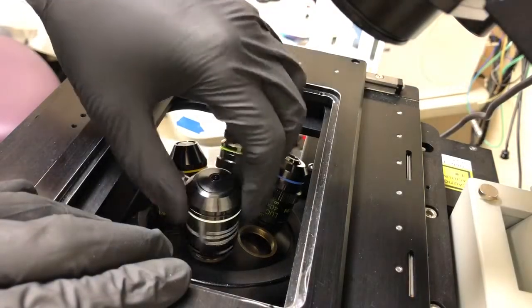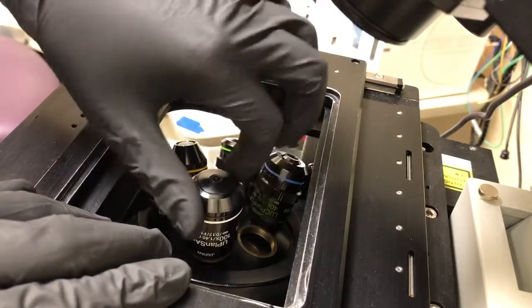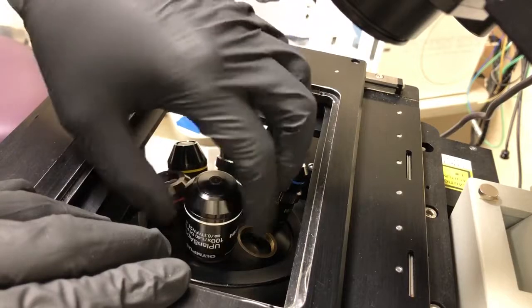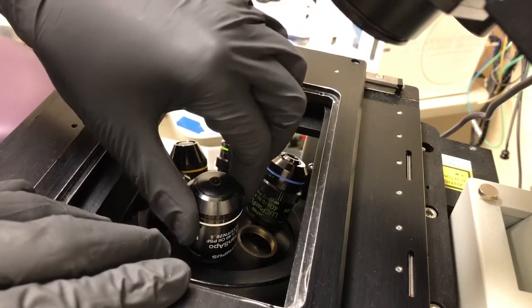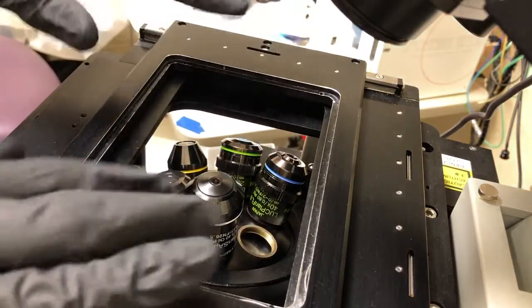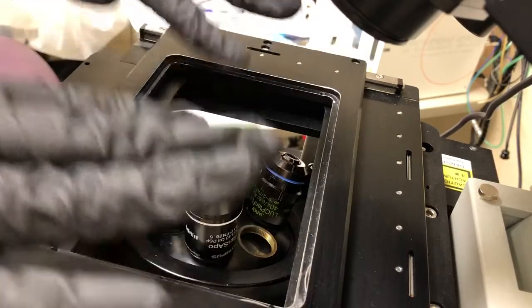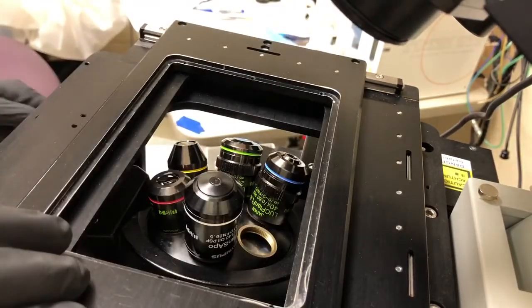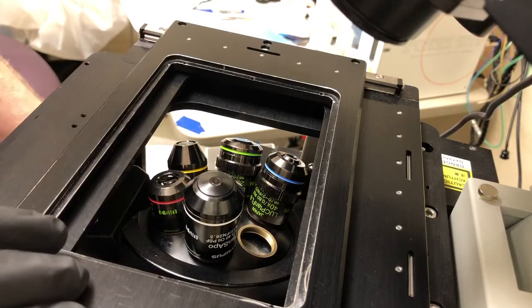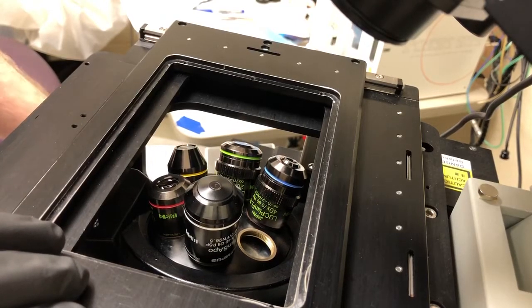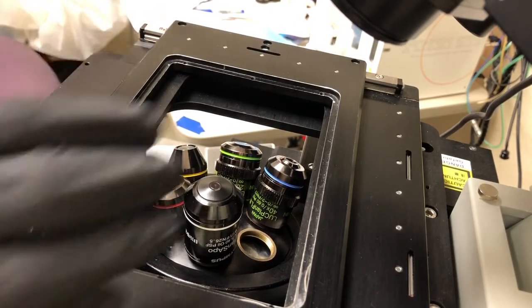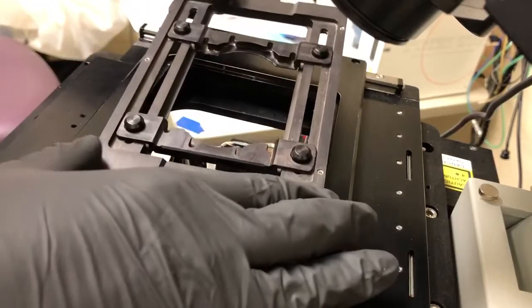I've placed it in there. Now, when I put the stage on, I want to make sure this is far away. So I'm going to click Escape on the microscope. That lowers the objective. Now I'll very gently put this in without banging into the objective.